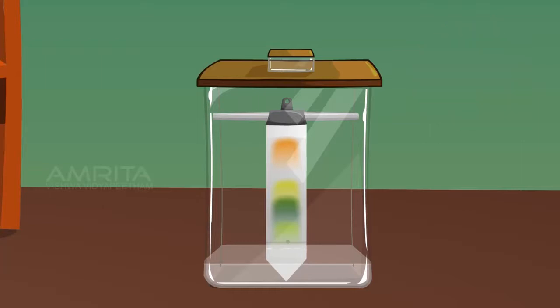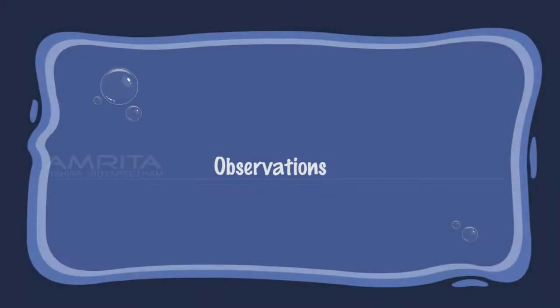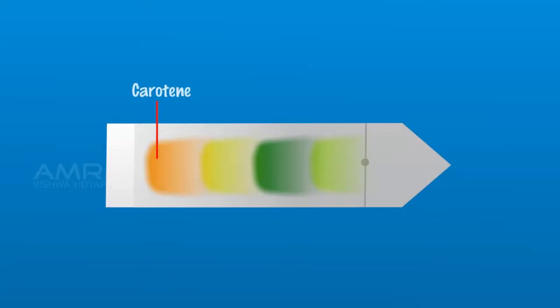Take out the strip carefully and let it dry. Observations: The dried chromatographic paper strip shows four distinct pigment bands. Different pigments can be identified by their colours.